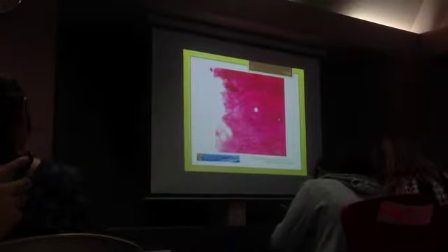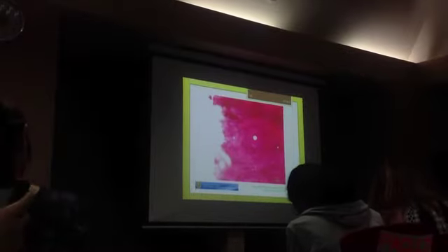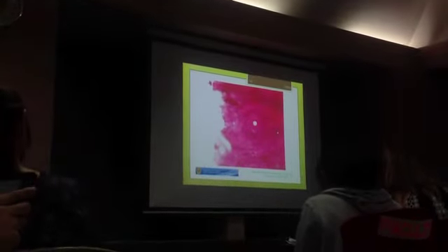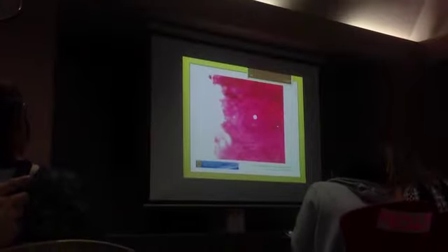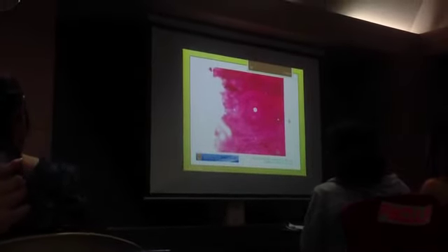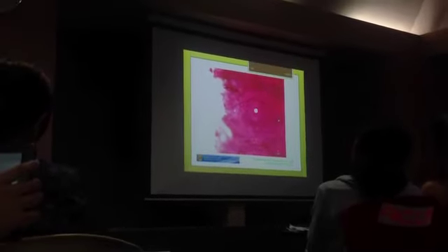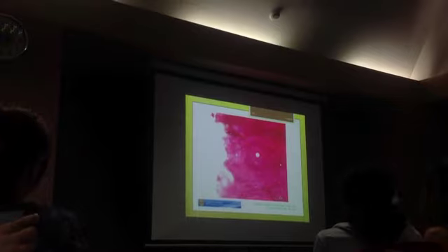Another name for lamellar is mature bone or secondary bone. The woven bone is the immature bone or the primary bone. We don't have a slide of that, the primary bone.